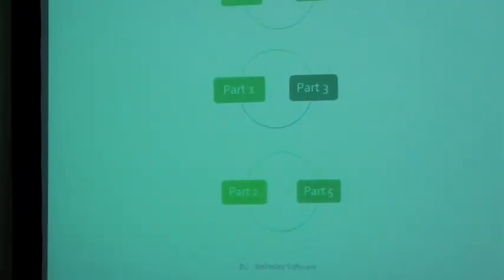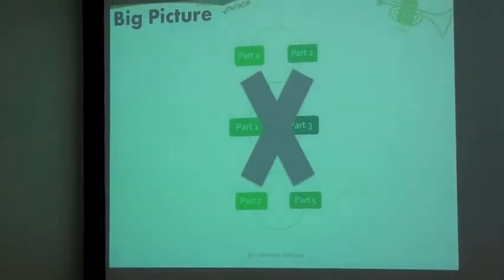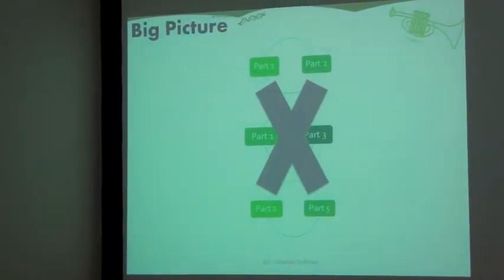So now we know what genes we are interested in studying, and we can effectively biobrick these genes, but we're actually interested in how these parts interact with one another. So let's imagine that we're interested in 5 different parts. If we want to study a system composed of these 5 different parts, we first need to characterize each subset of these parts. This means building many different plasmids with many different combinations of these parts, which does not sound fun for our wet lab.